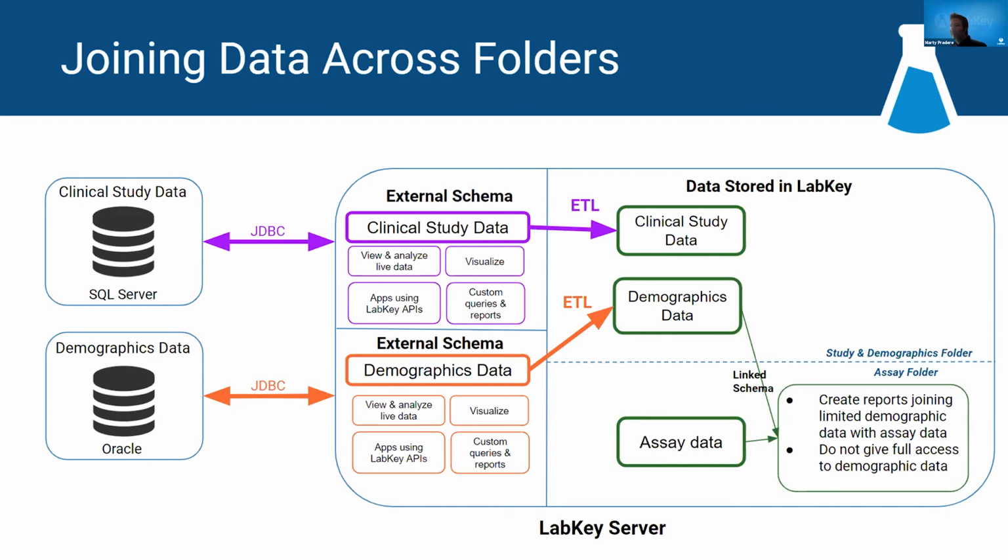Does LabKey support transforms into FHIR? So I'm not as familiar with FHIR. You can really do transforms into whatever you want with your data. We don't have a built-in standard for, it looks like, Fast Healthcare Interoperability Resources. And I guess it's part of HL7.